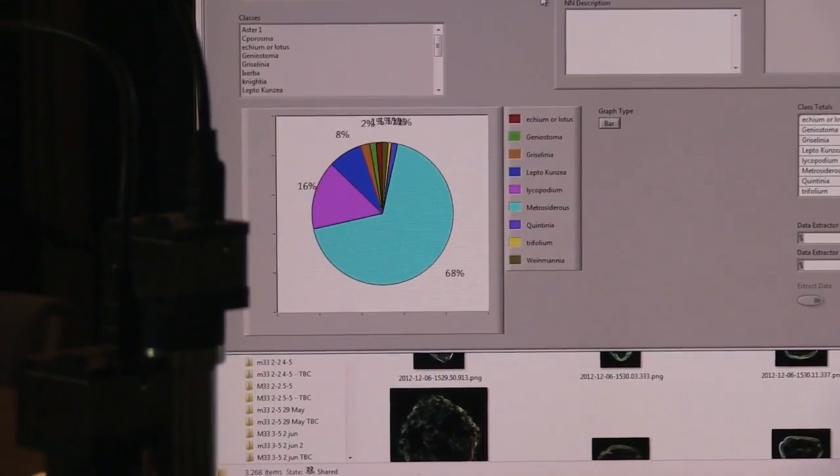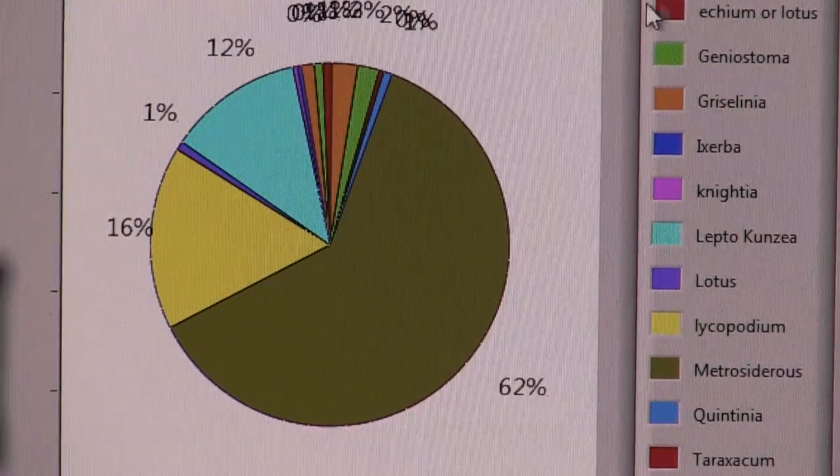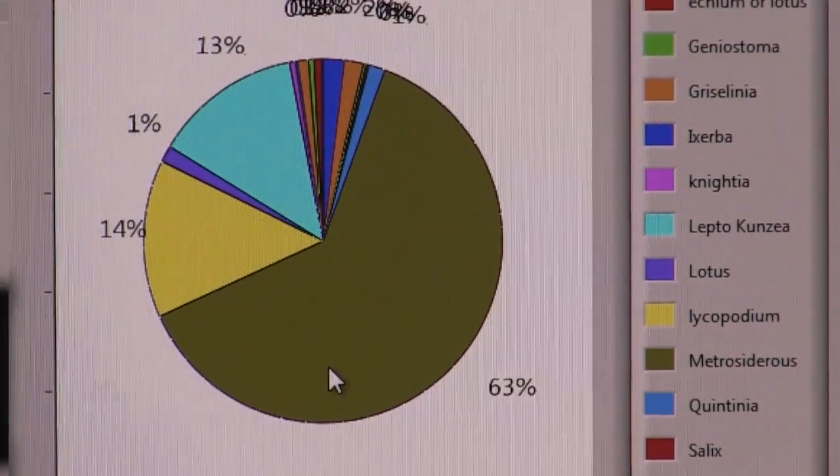And there you can see the system progressively classifying the pollen types in that set with the pie chart constantly adjusting to show the proportions of the taxa as they're identified.